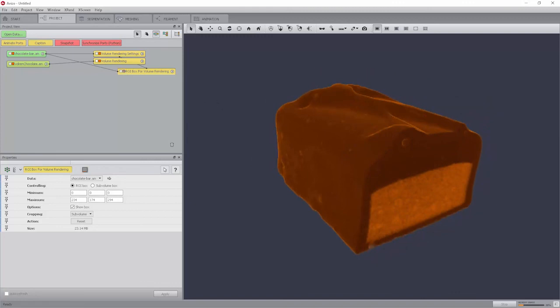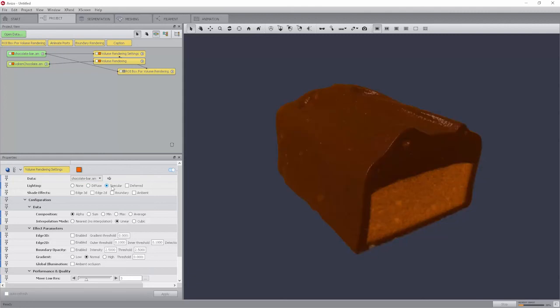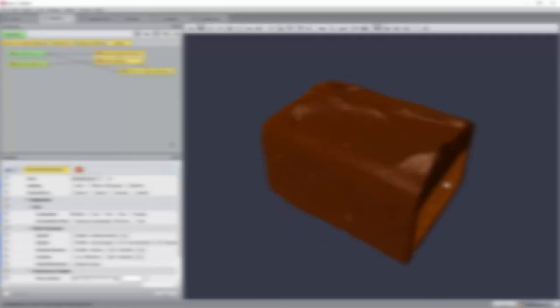There are many advanced settings available to configure the rendering, which are available from the volume rendering settings module after switching on the advanced mode. For example, set lighting to specular. Please refer to the user's guide for more details on these parameters.